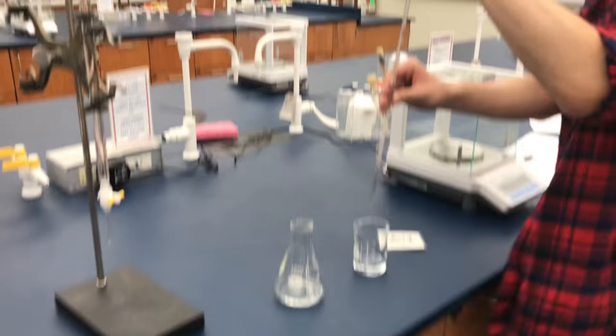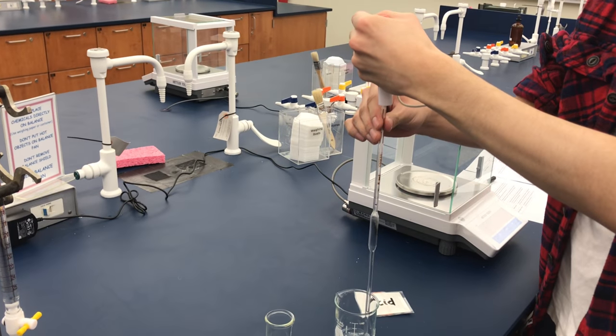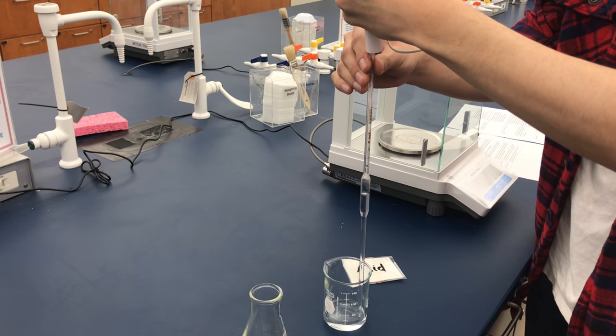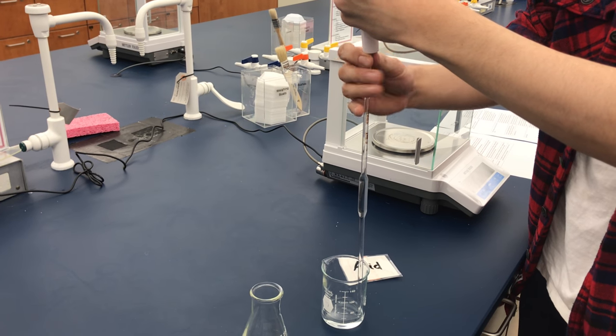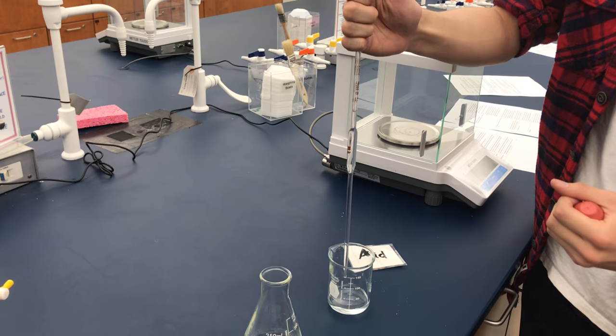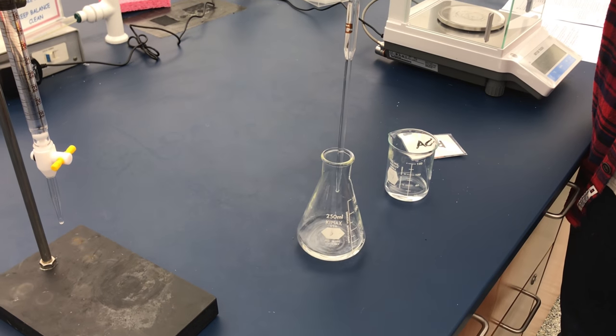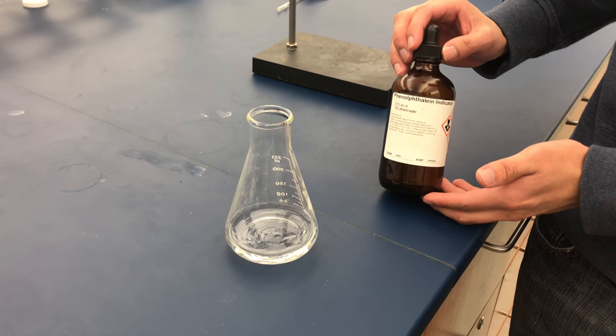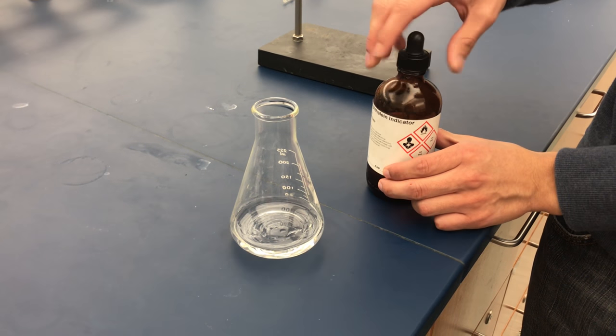Dispense a known volume of the unknown solution into the flask. Record this volume, then add one or two drops of indicator.